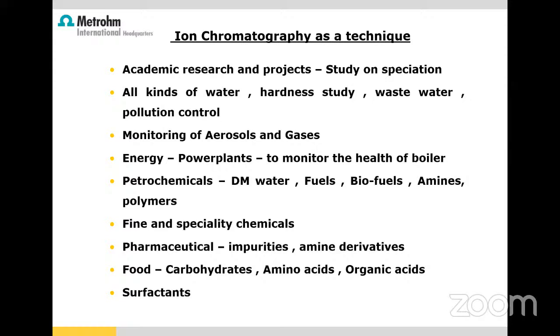Food, similarly, carbohydrates, amino acids, organic acids, surfactants, anionic and cationic surfactants can be determined. So this is the wide range of applications of ion chromatography. We will see a lot of applications. I will show you some examples also.